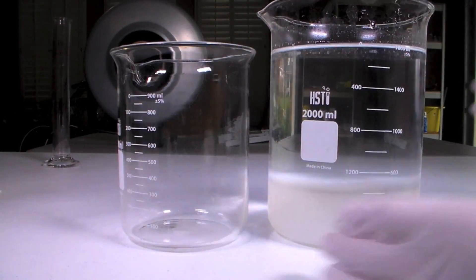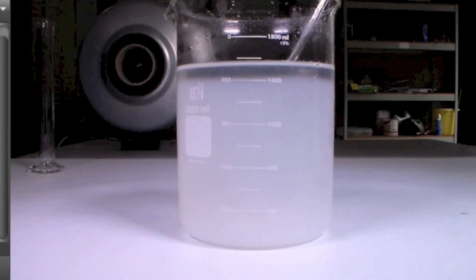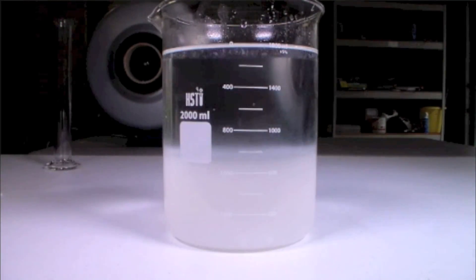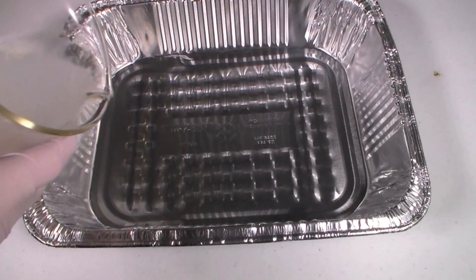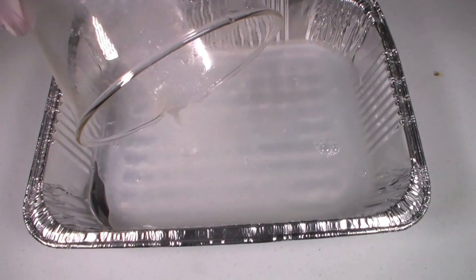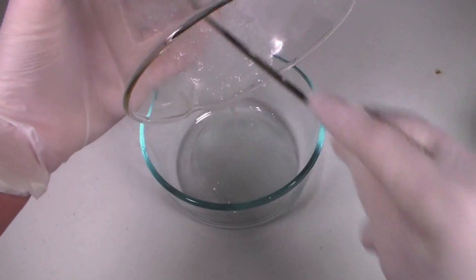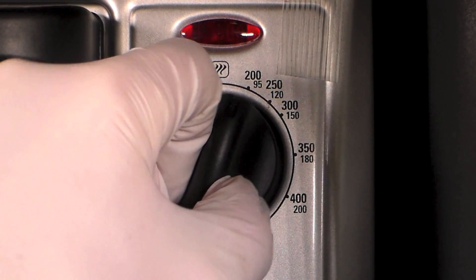After the mixture settles, decant off the water and leave the aluminum oxide in the beaker. Then wash the aluminum oxide two more times with water, decanting the liquid after each washing. After the last washing, I poured off the upper layer that contained mostly water and only a small amount of aluminum oxide. I then scraped the rest of the aluminum oxide on the bottom of the beaker into a lab dish and dried this in an oven at 150 degrees Celsius.